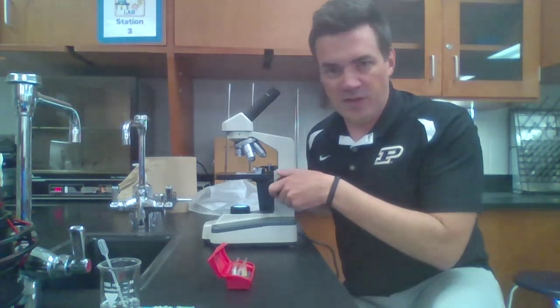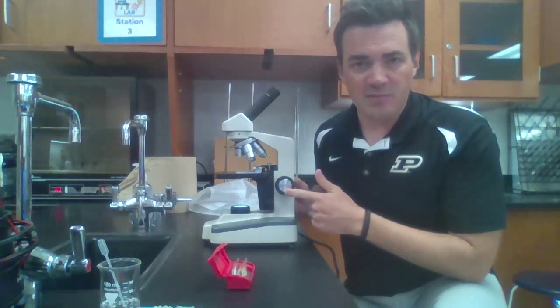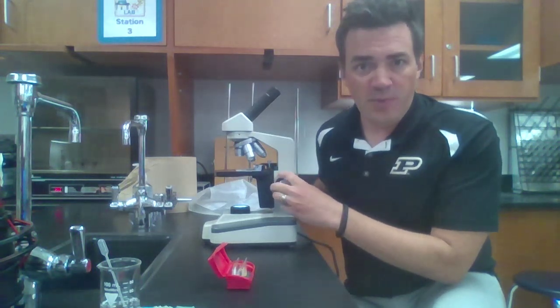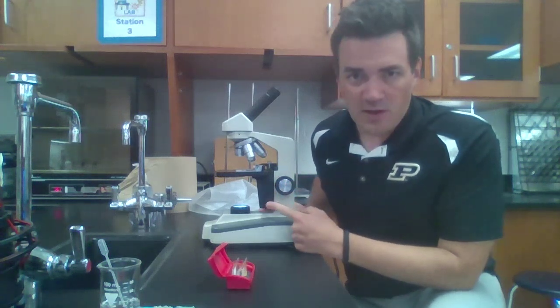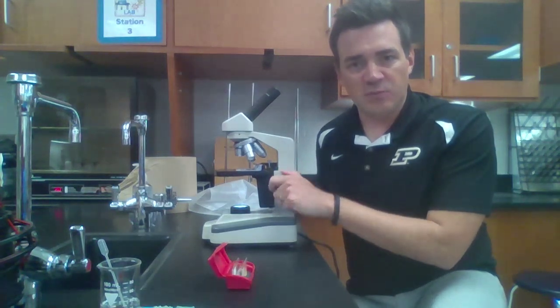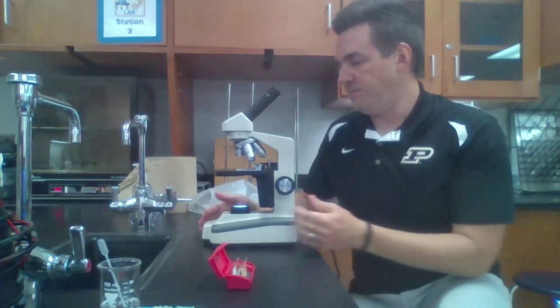When you do that, you're going to be able to adjust using your coarse adjustment knob to get that slide into focus. Only on low power should you really ever use the large knob. You can use the smaller knob when you are on higher power. The reason for this is the coarse knob moves the stage really quickly, the fine one moves it very slowly, and we don't want to smash our slide and our stage into our lens.